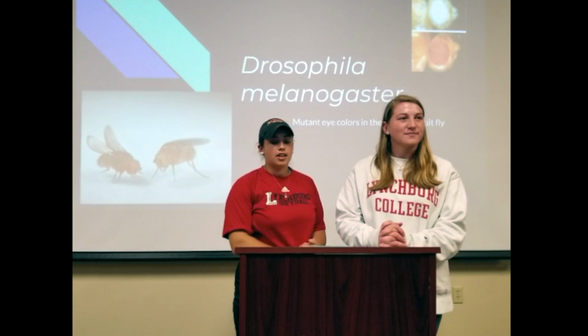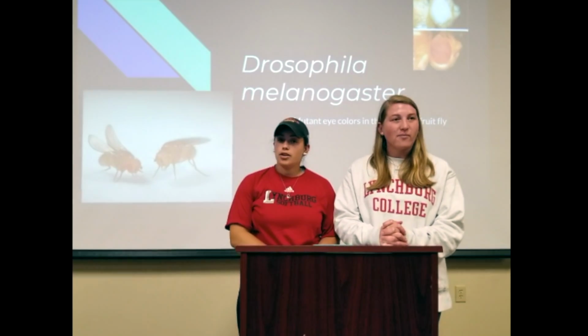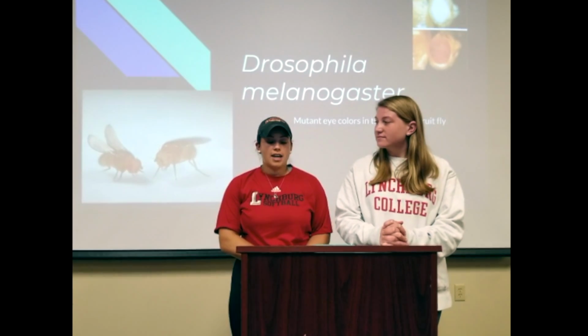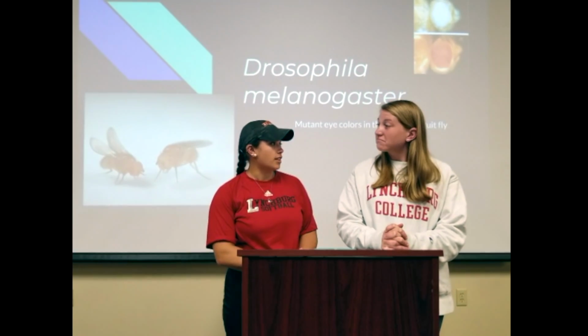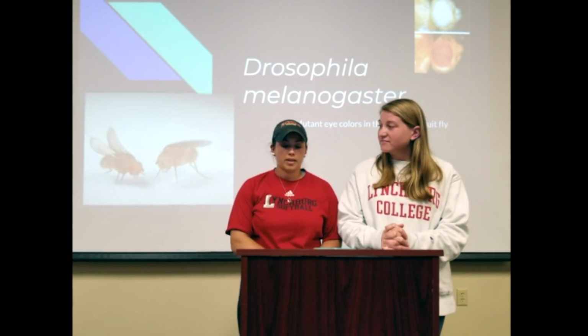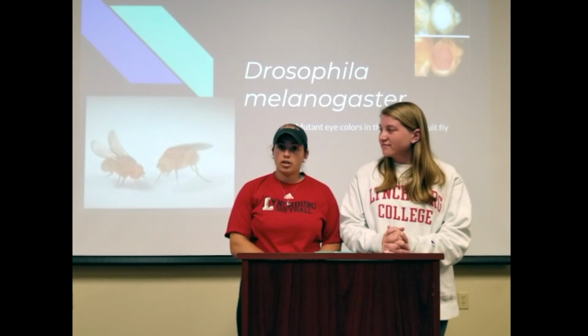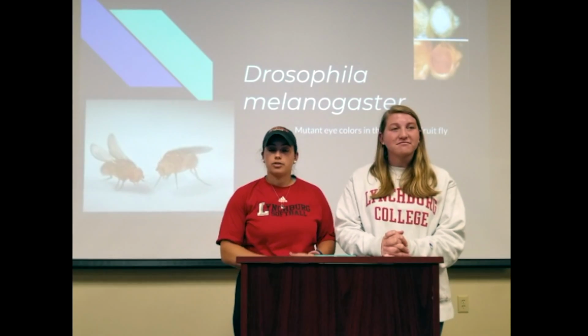We're going to talk about the Drosophila melanogaster and how it's a common fruit fly. Did you know that the Drosophila melanogaster is a model organism and that it actually has a short lifespan, and that's why it's easy to maintain within labs? A lot of biologists use them to study the chromosomes and genomes. They have a small number of chromosomes, and they can be used in research for human genetic disorders.